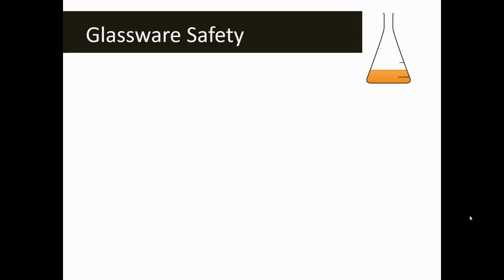The first safety symbol that you might see is this Erlenmeyer flask symbol — this is our glassware safety symbol. It just means that we're going to be using something that's made of glass. This could be a test tube, a beaker, a glass stir rod, or like you see in the picture, an Erlenmeyer flask.